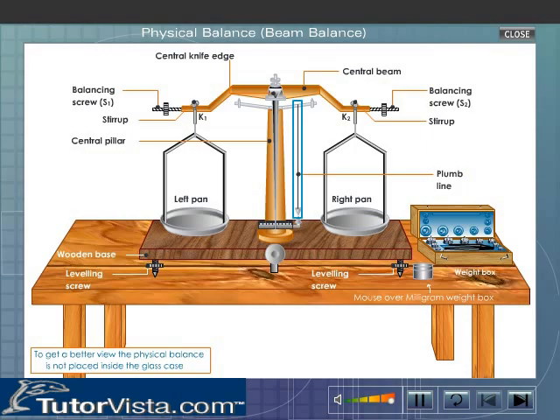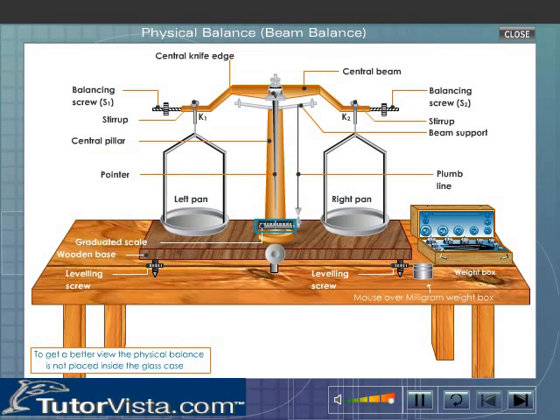A plumb line which is used to set the balance in the horizontal plane is suspended from the beam support. A pointer is fixed in vertically downward direction. The pointer moves over a graduated scale attached to the central pillar.